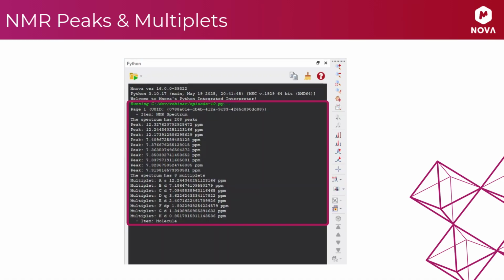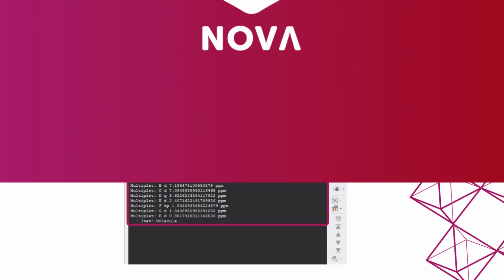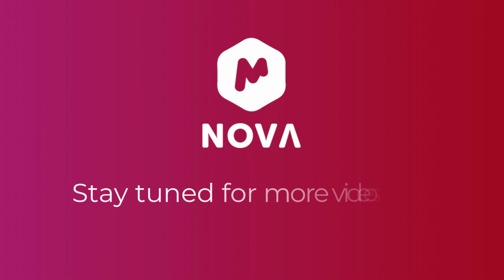Try running this script on your own spectra and see how much information you can uncover with just a few lines of Python.